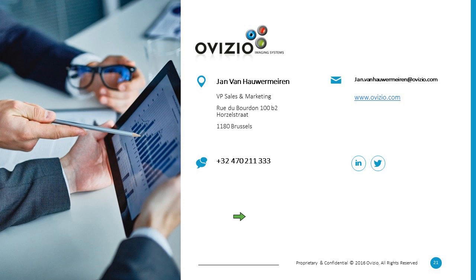I won't go into much detail right now, but as we are working with very fine optics and very fine optical setups, as soon as you start to multiplex, you need those optics to be able to move around, which combines with very high cost. And in the end, the cost of a multiplex device is much higher than the cost of multiple one-on-one devices.